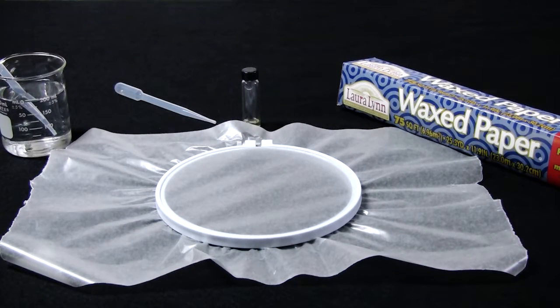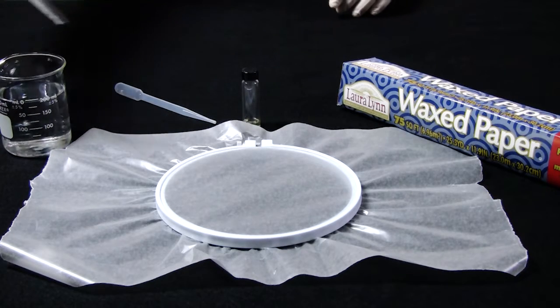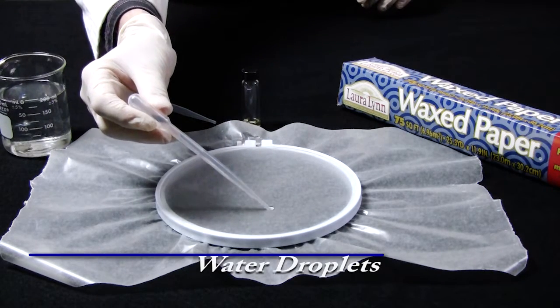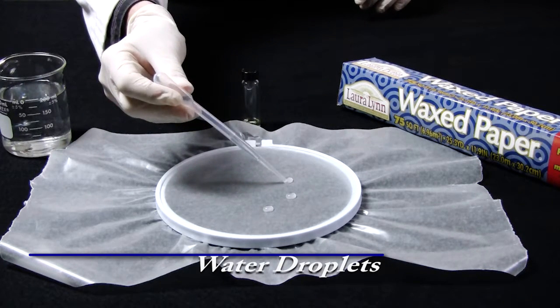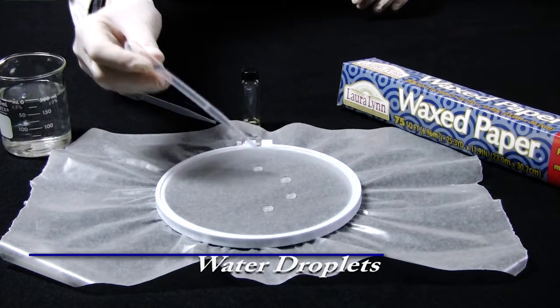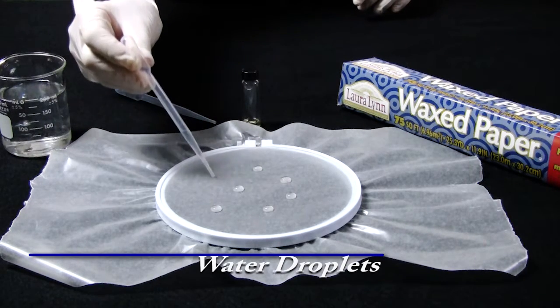First, the laboratory technician takes several drops of deionized water and places it on wax paper. Deionized water has a surface energy of 72 dynes. Paraffin wax has a surface energy of 26 dynes. There is a 46 dynes difference, and because of that, the water does not wet out the paraffin wax. Instead, the water beads up on the wax paper.